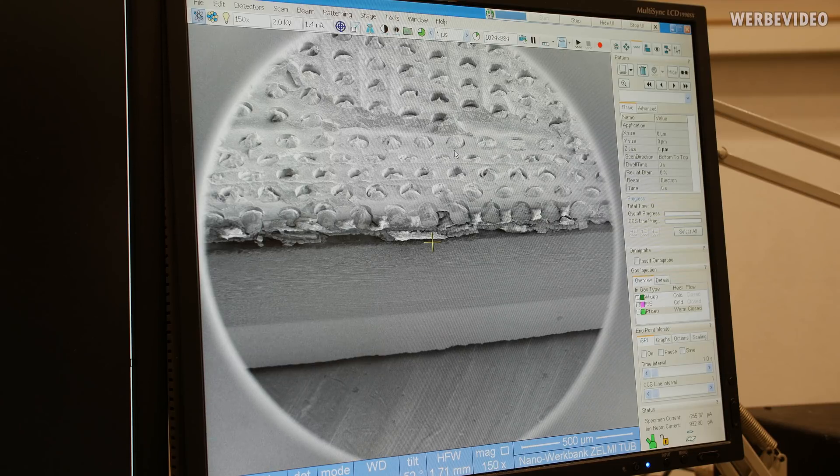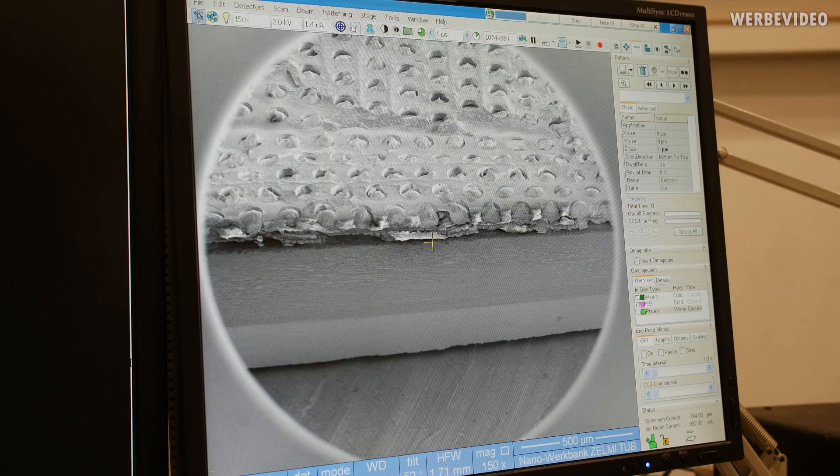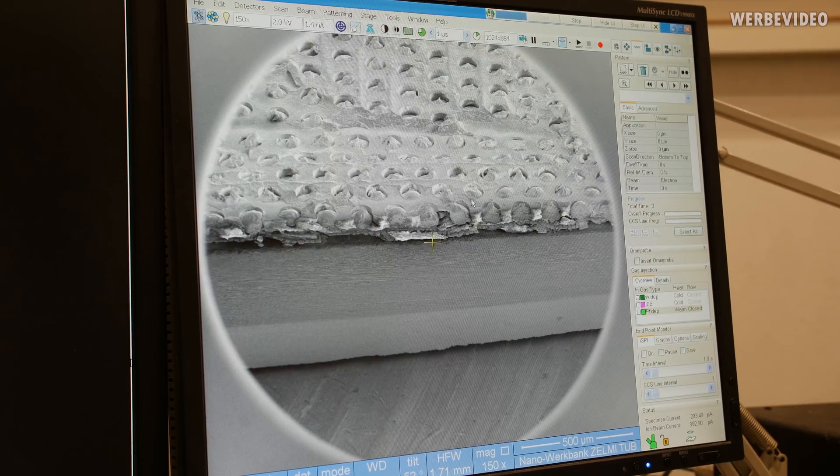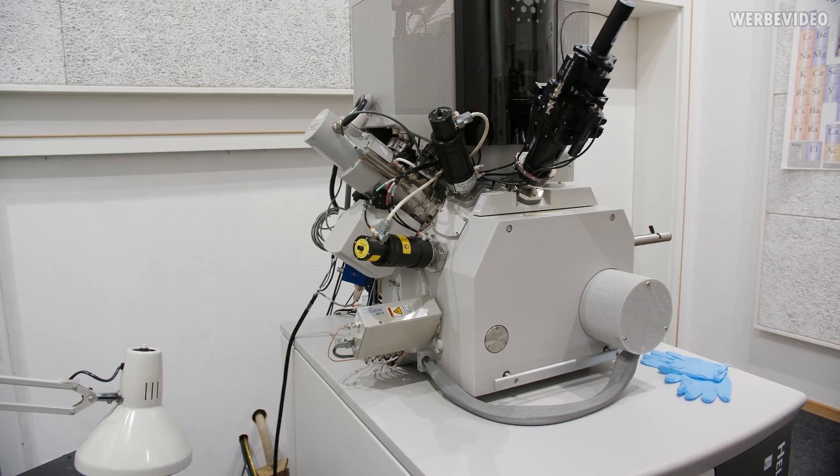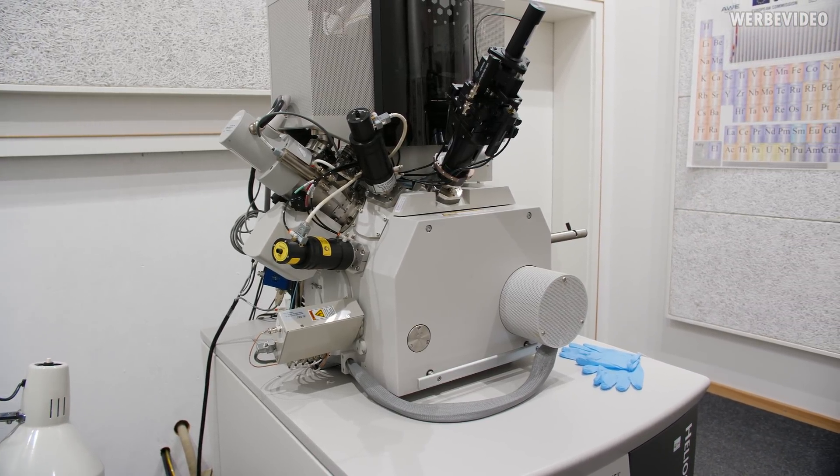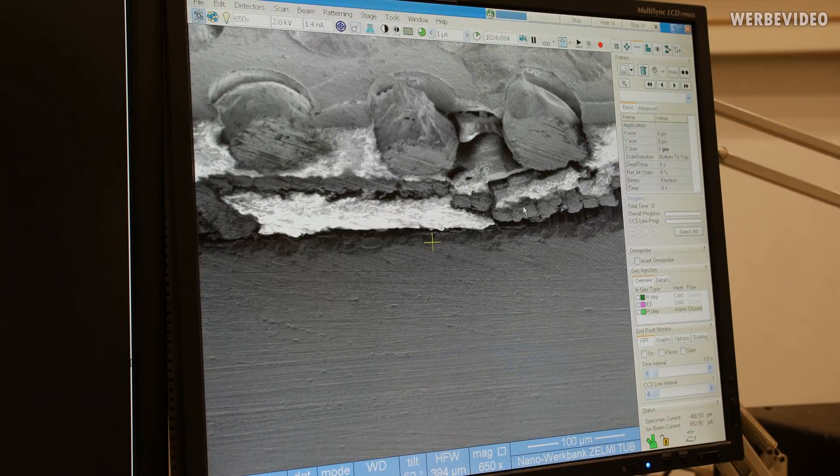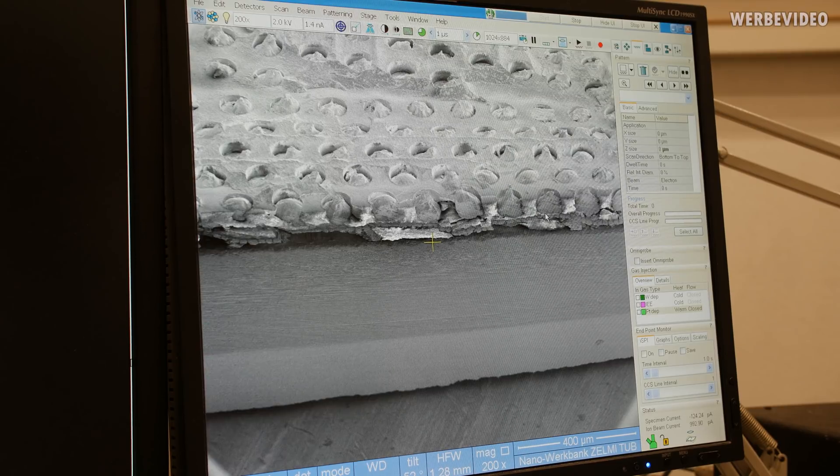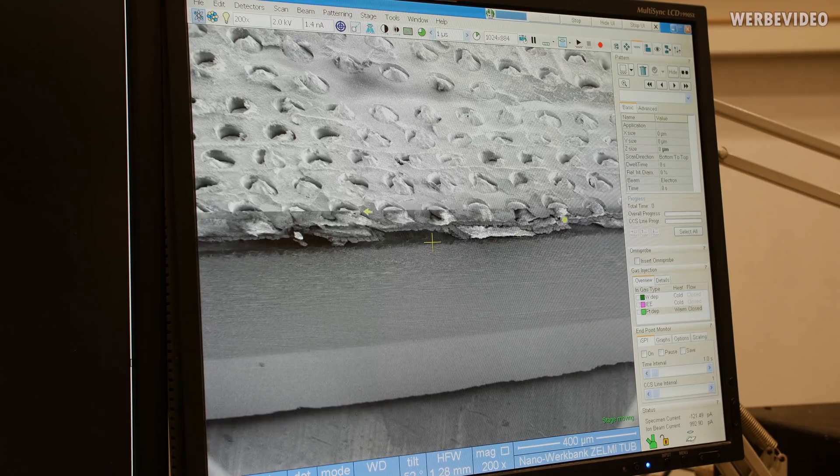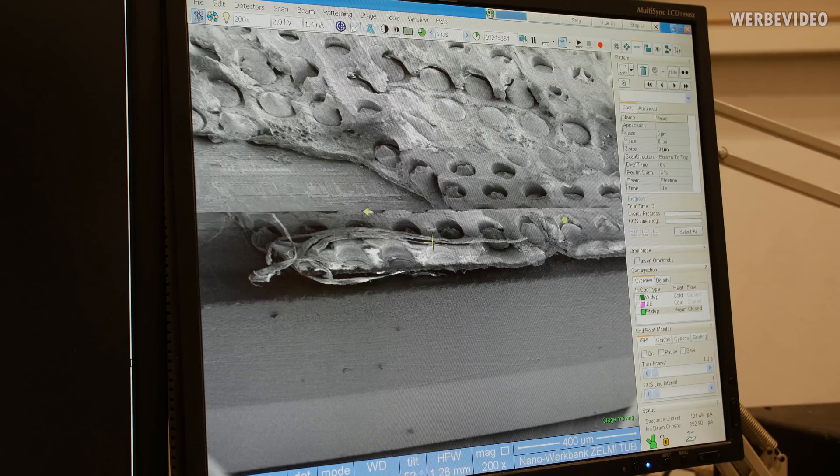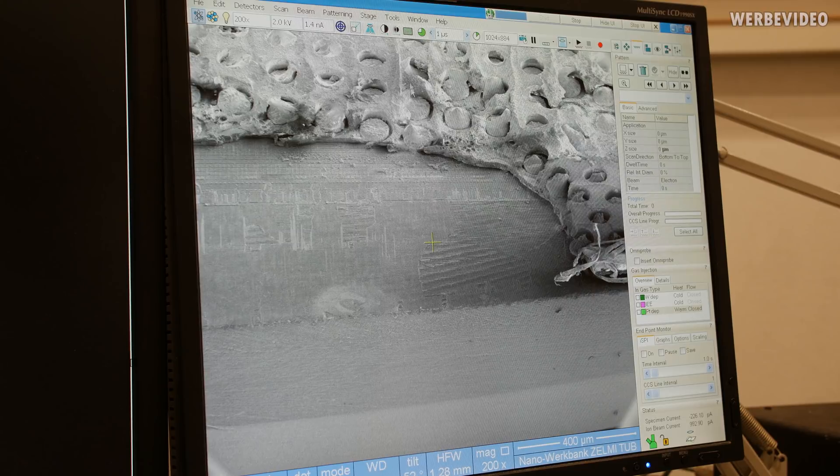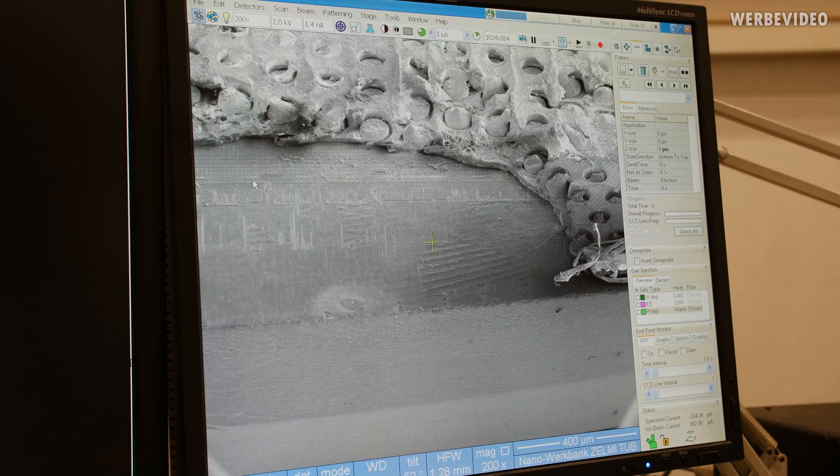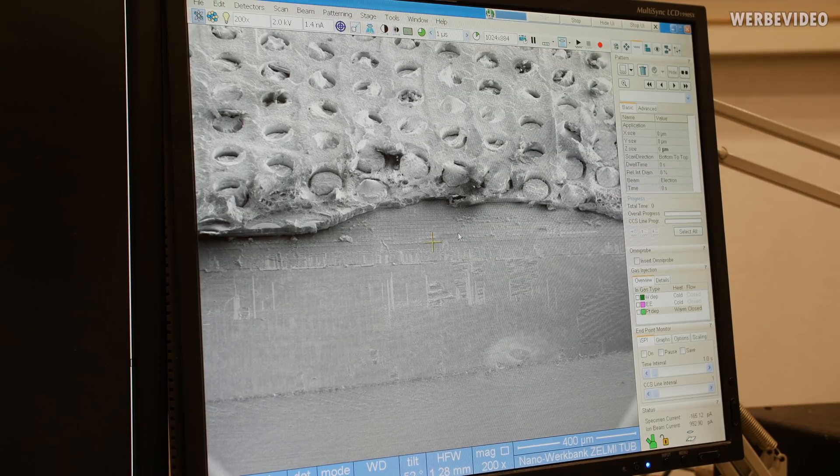The solder bumps look a little bit different compared to the previous image because it's a different preparation of the specimen, but it doesn't matter because we are not interested in the solder bumps. So this is now the scanning electron microscope, so I can easily change the magnification to see more smaller details. Or I even can shift the specimen a little bit and we are looking now for some area on the sample where the layer of the solder bumps is already removed. And here you already can see some parts of the transistor structures.